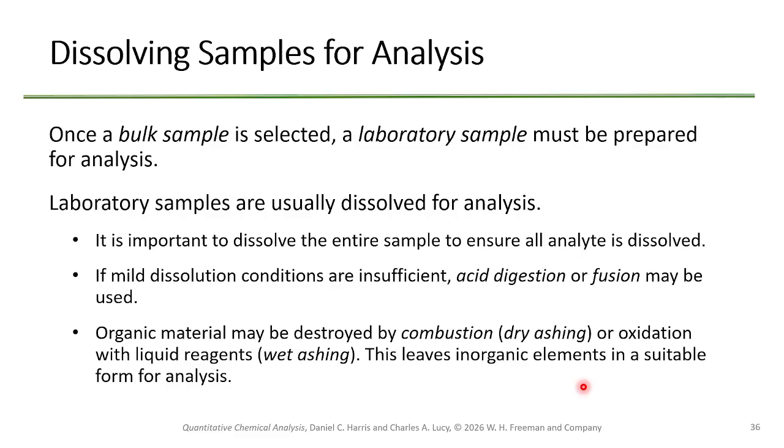Now, we'll talk more about this in instrumental, like PACE Analytics. When you did the tour, if you haven't done the tour yet, you saw that they use matrices that can absorb materials and release them one at a time. They somewhat sidestep this issue by simply separating the materials.